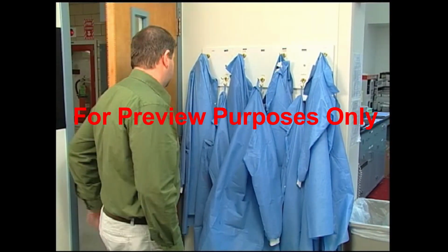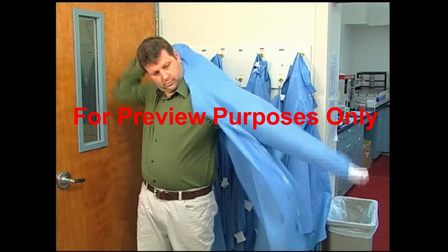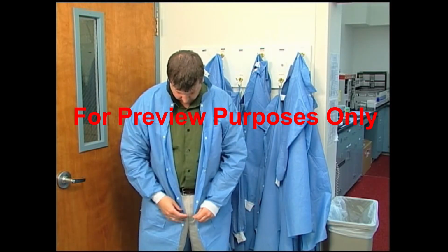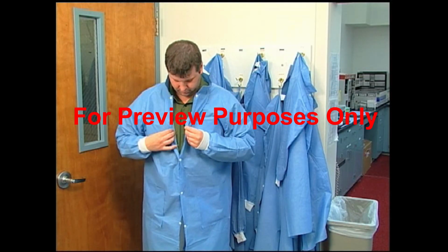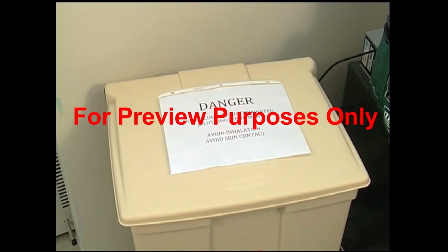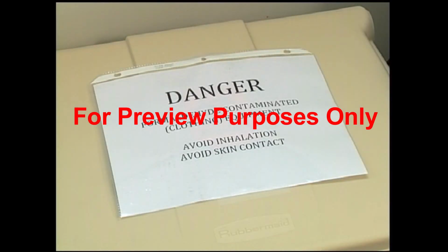In addition to gloves, eyewear, and possibly a respirator, you're also going to need some type of protective clothing to shield you from splashes when working with formaldehyde. Lab coats are the most common, but they and any other clothing you wear must be impervious to water to fully protect you. If your protective clothing ever becomes contaminated, you should immediately dispose of it in your facility's authorized disposal area. Then get a replacement before you start back to work.